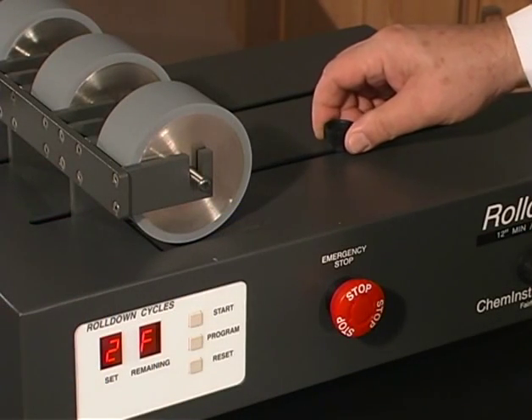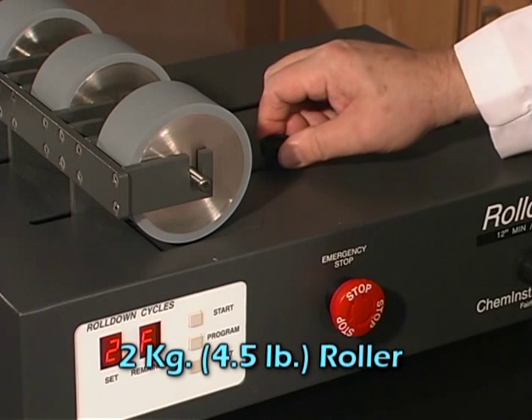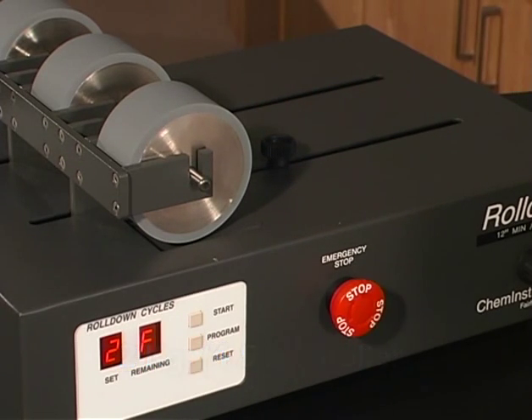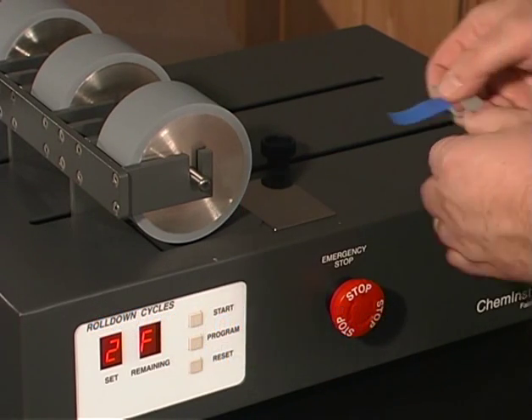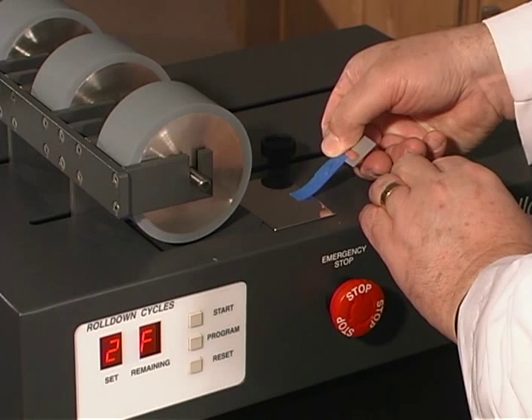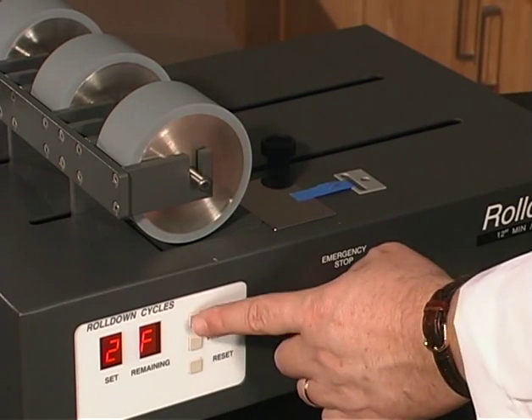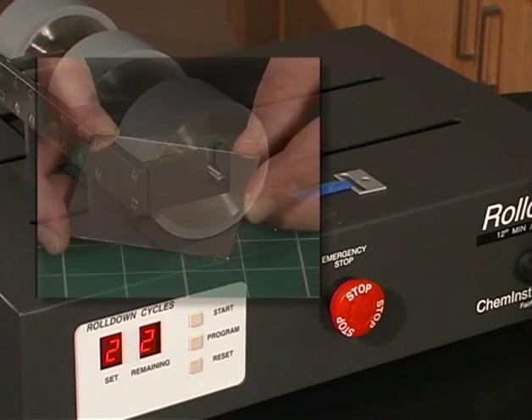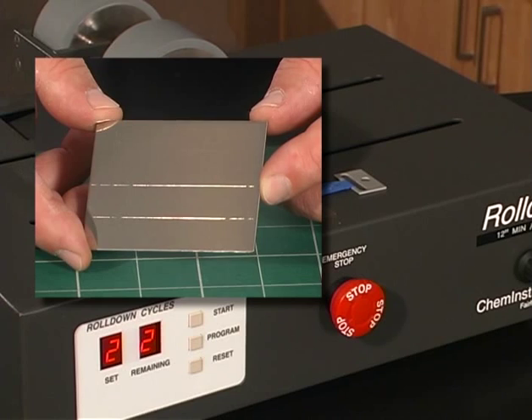Apply exactly 12 millimeters of the sample to the test panel using a 2 kilogram hand roller or mechanical roller at a rate of 600 millimeters per minute. The test panels used in this demonstration are from Chem Instruments Incorporated and include scribe lines for 12 millimeter and 24 millimeter sample areas.